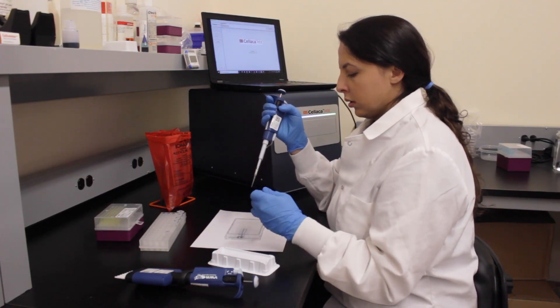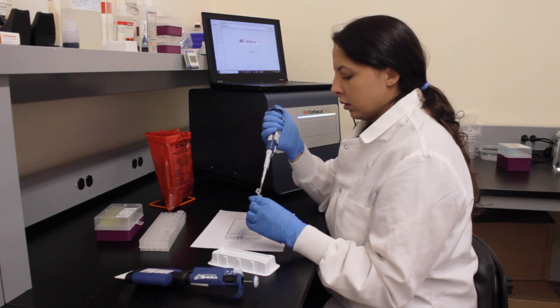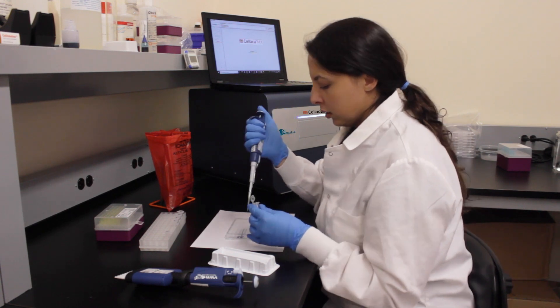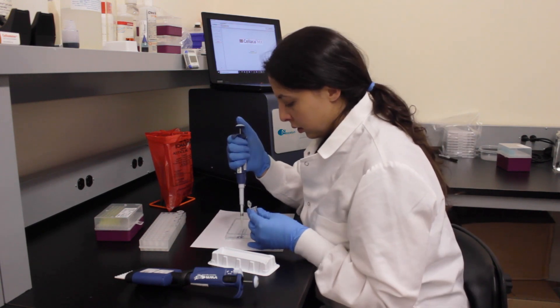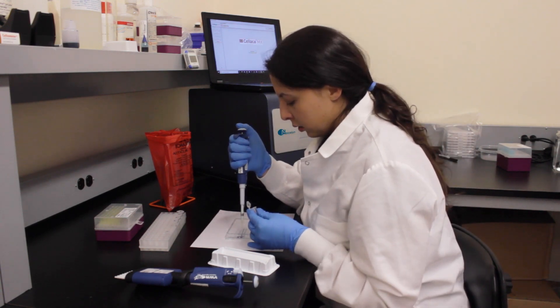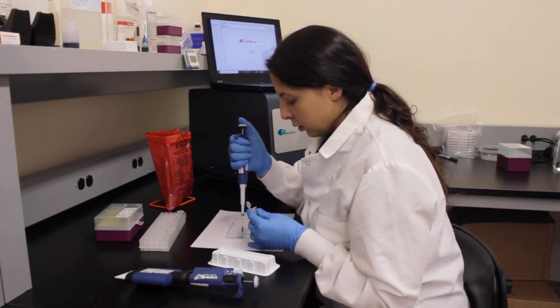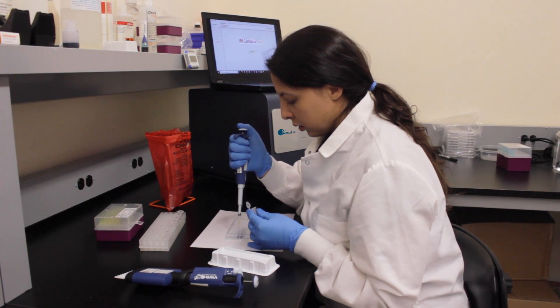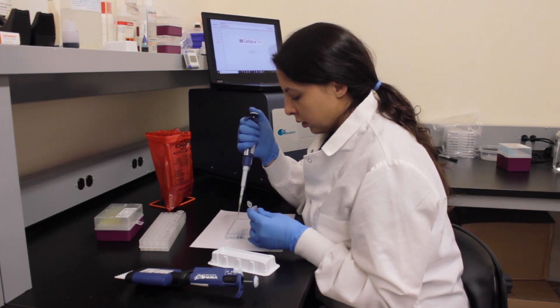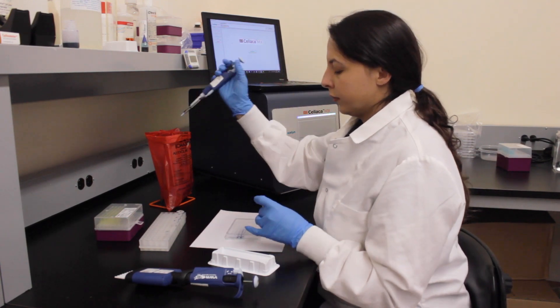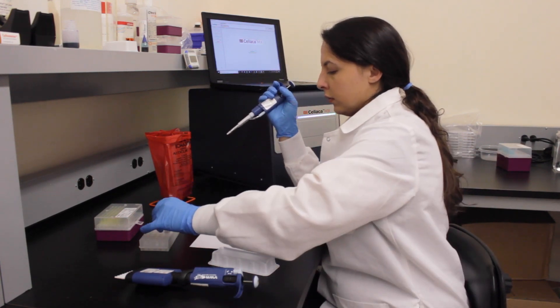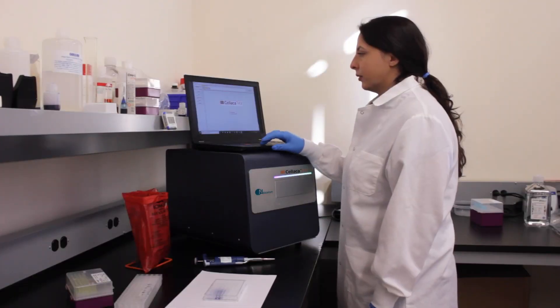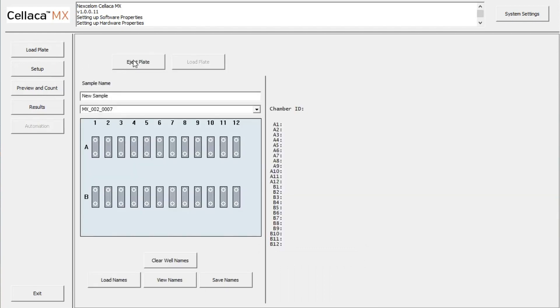By mixing your sample directly within the Cellaca plate, there is no longer a need to perform that step in an Eppendorf tube. You can now mix, load, and repeat for the rest of the samples. You are now ready to load the plate.